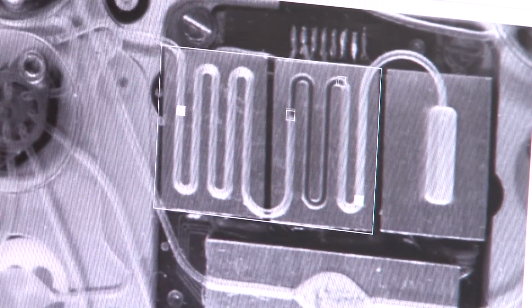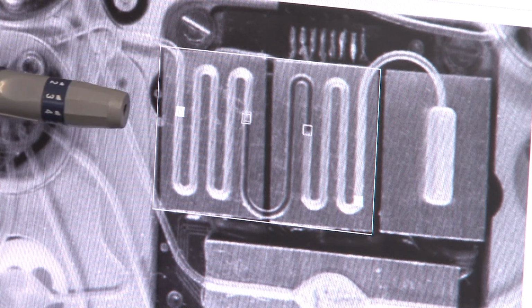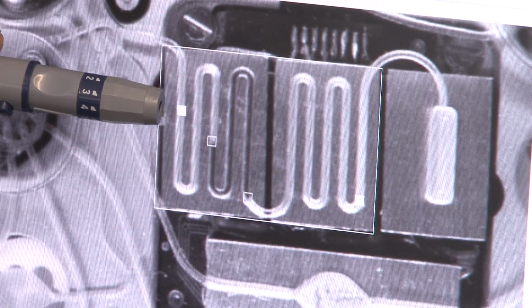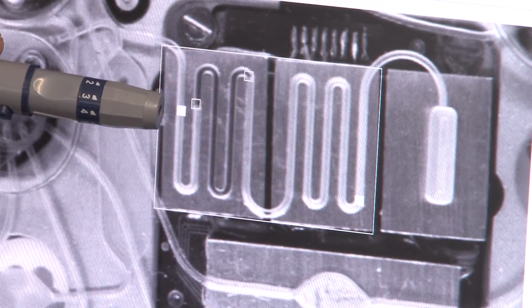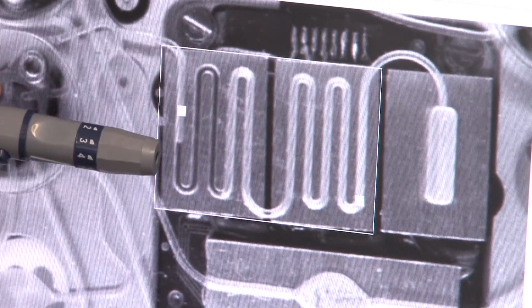Because the lamps are not quite visible, I will show you. The first alarm is here. I don't know if you could see a rectangle blinking when we reached the alarm, and the second one is here. You will see when we reach it. As you can see, the camera software detects the liquid at both sides, at both ends. It waits again at the cold zone, and then it will move back to the hot zone.